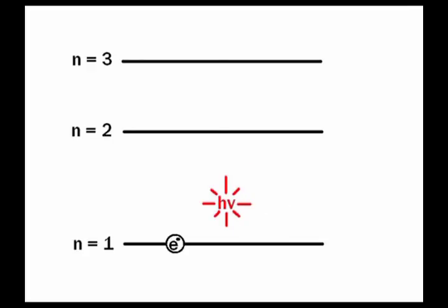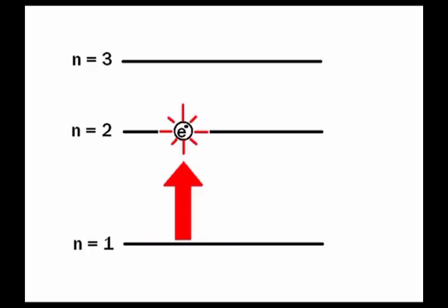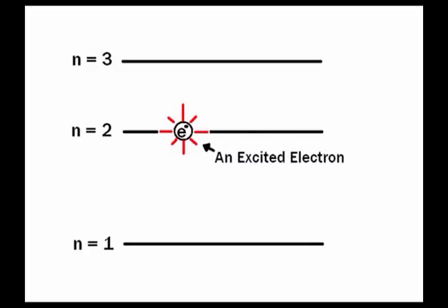When it becomes an excited electron, it becomes unstable due to the energy gained. So what must it do? The electron tends to lose the energy gained to be stable again. So it drops to the ground state again and emits the energy it gained in the form of a photon of light, and that emission we can see with our eyes.